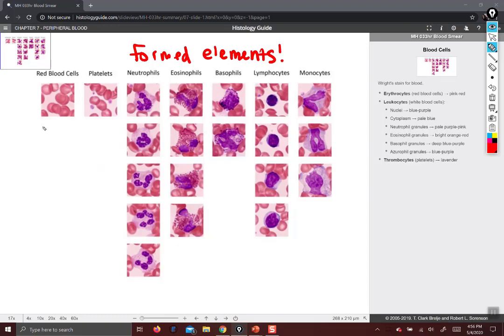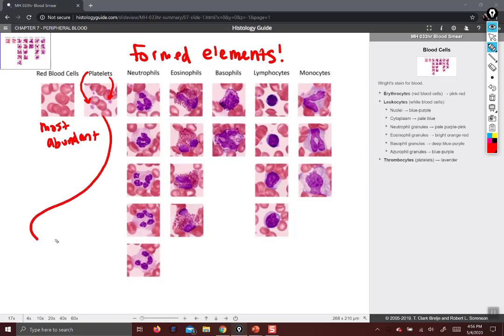Red blood cells are obviously the most abundant, and they look like little toruses. Toroid means almost a donut — they're pinched in the middle, they're hollow, they don't have a nucleus. Platelets are these little guys. They're fragments of a larger cell called a megakaryocyte. You don't see megakaryocytes in the blood; you only see them in the bone marrow.